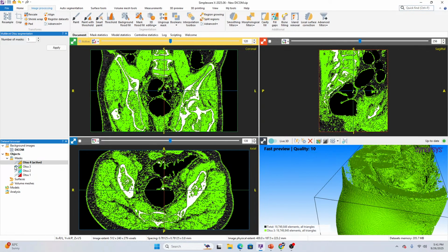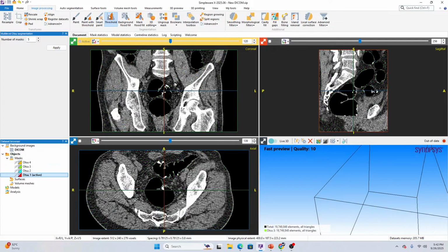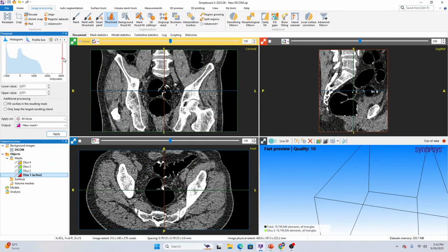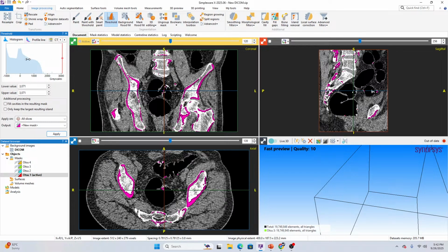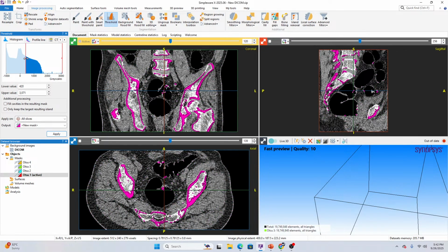There is one more option that we can use. If we do not want to use this one, we can work on a peak-to-peak basis in the threshold value. So we go in the threshold tab. You can see there are different peaks to be observed. If I am taking a bone, for example, till this peak, I'll delete this particular existing part.